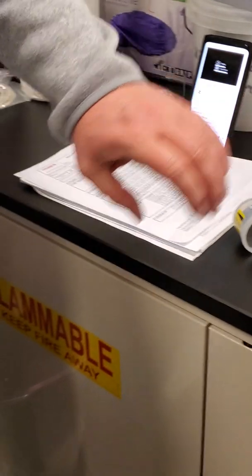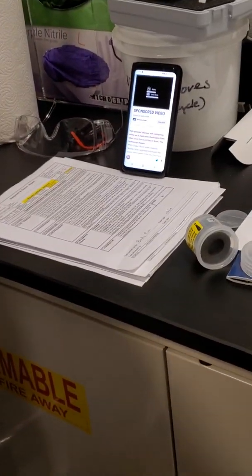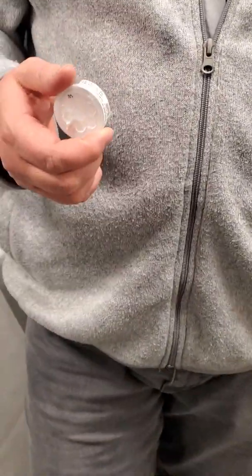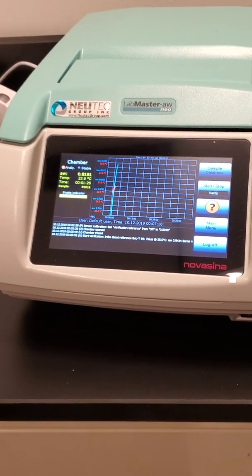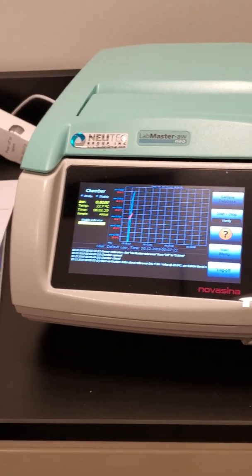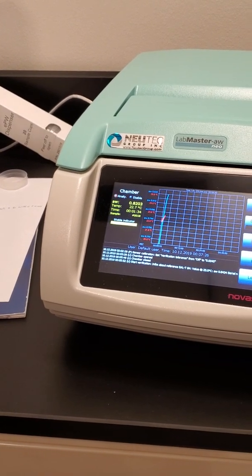So one thing is if that starts to harden up, and there's no liquid in there, that's an indication that they've gone bad. Or if you just can't get the things to calibrate, so you read one standard and it reads fine, and another fine, and then one just won't read, that's an indication that that standard's probably gone bad. And you can buy additional standards from us. I see. Okay. But again, about 3 years, it should be good.